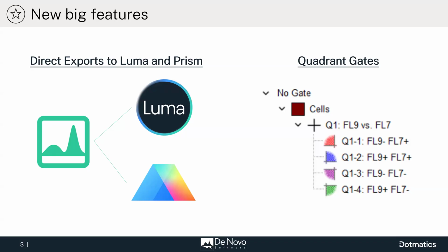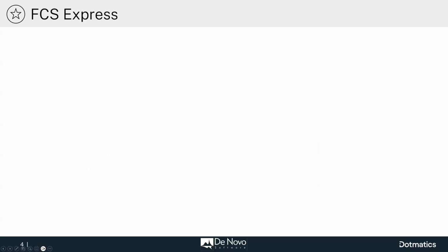We'll also talk about your current layouts that were built before this functionality was available. FCS Express is always backwards compatible, meaning that you can always open your old layouts in a new version, but not the other way around. So you will definitely be able to open your old layouts if you update to 7.24. We're going to open an older layout, show you what things look like, and how to manage the quads that were created before this functionality was available. Okay, so let's go ahead and open the software.